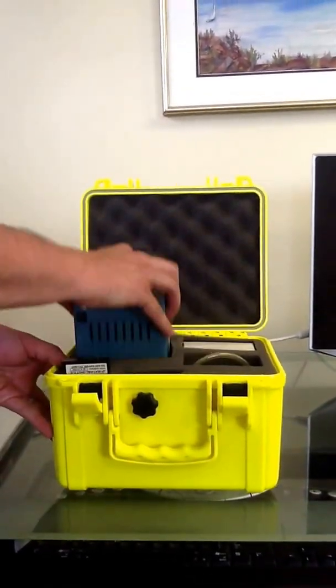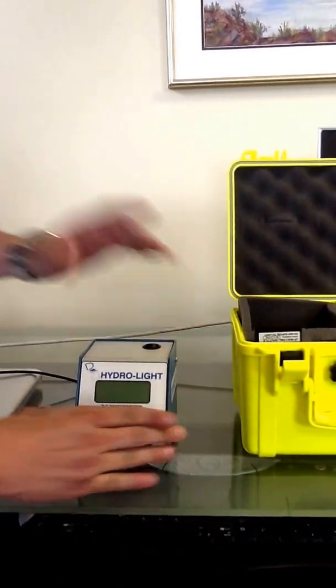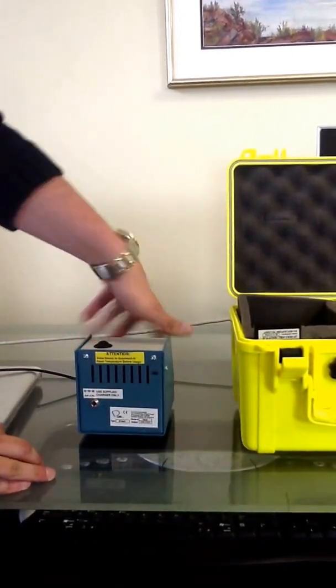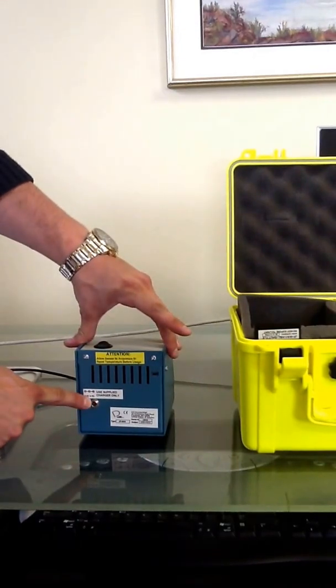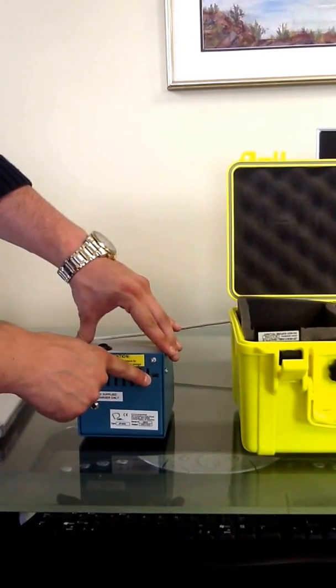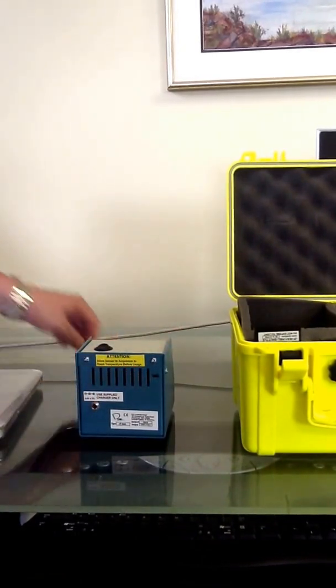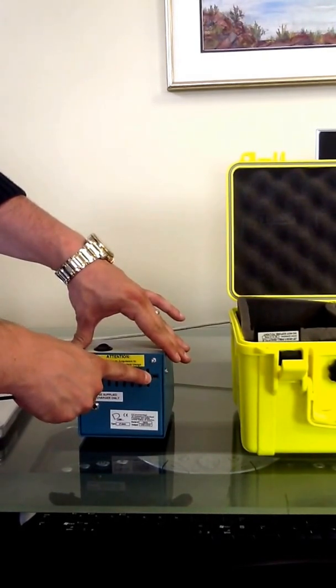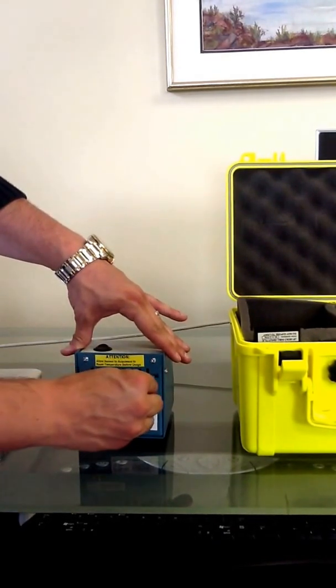Inside the box, you can see we have the JFWA-1 Hydrolite, which on the back here is powered by either a wall charger input, which comes standard with the device, or a standard mini USB cable, which we're going to power it with today. You can also output the data to any standard PC or laptop through this USB input-output port.